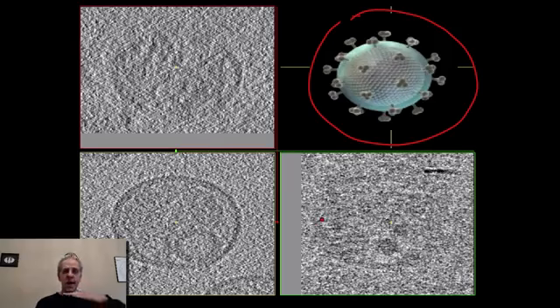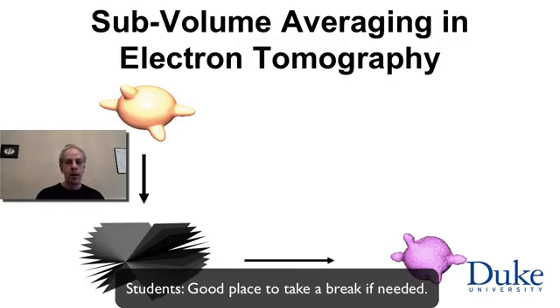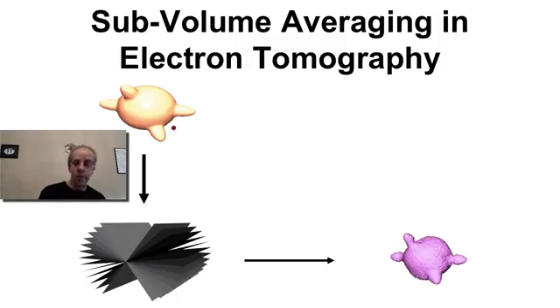Again, these are just slices on the 3D volume that was reconstructed with cryo-tomography. This is what we have. This is the process that we have. We had basically a virus or a structure inside a specimen. We took multiple projections. Look how I represented here the missing wedge. We didn't take the whole around projections. We basically have a missing wedge here. So we took that and we get a noisy version in this 3D volume.